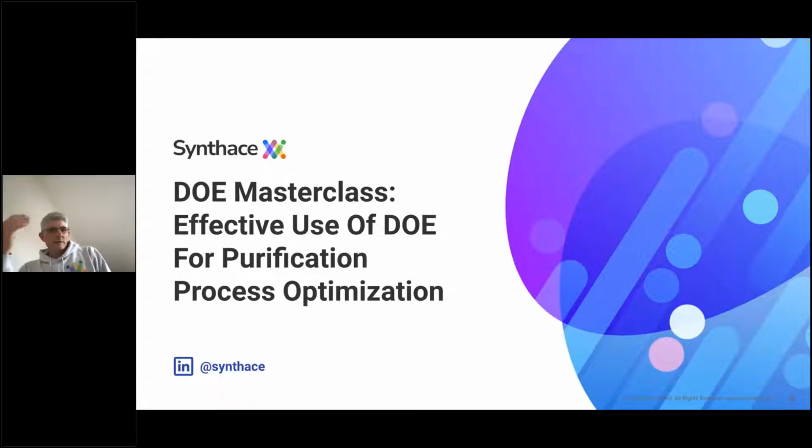This sort of situation is very common in bioprocess development, where it's a common strategy then to use scaled down systems to run our optimization. And in this talk, we're going to hear about some of those scaled down systems that can be used and how they can be used to do effective DOEs to get a good knowledge of the process landscape and to establish a process that we can then scale up ready for production.